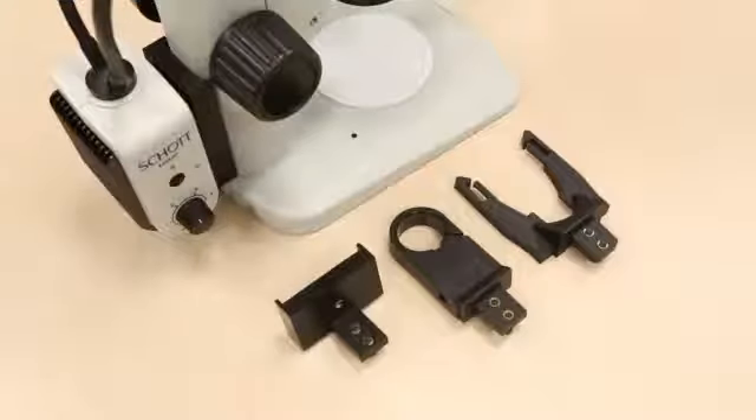We have four adapters that make up the EZLED series, one of them being attached to the stereo microscope post. As you can see, all control elements are ergonomically integrated into the device.